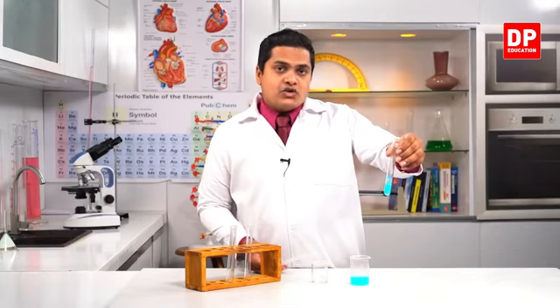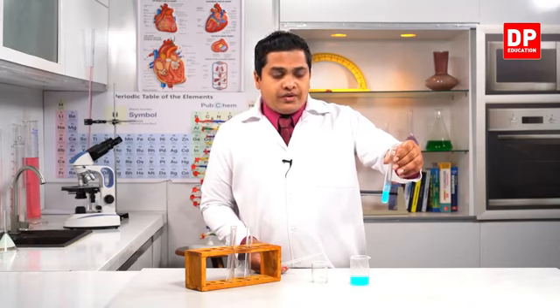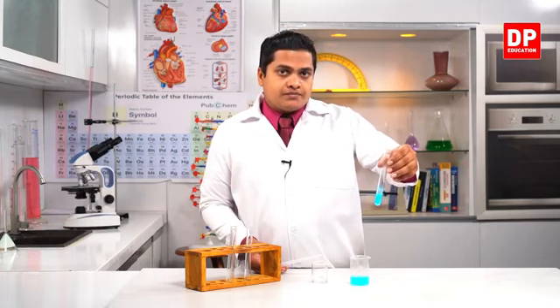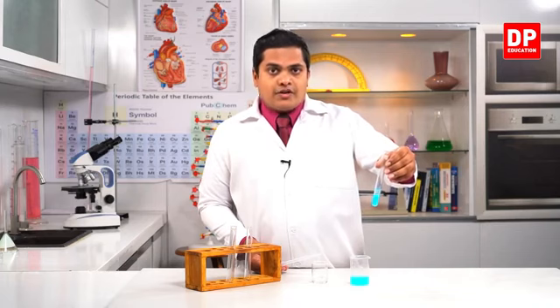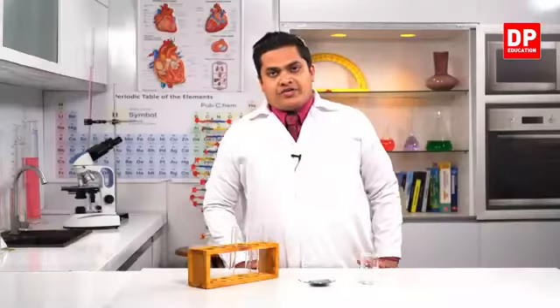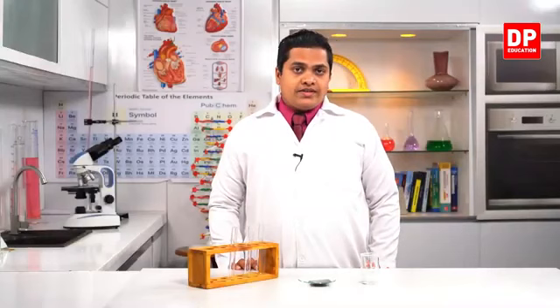So when adding sodium hydroxide to a copper sulfate solution, we can observe a light blue color precipitation. So like in the previous activity, here a precipitation has occurred. So if a precipitation occurs, it means that this change or this reaction is a chemical reaction, or else a chemical change.